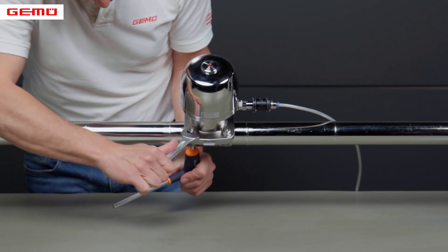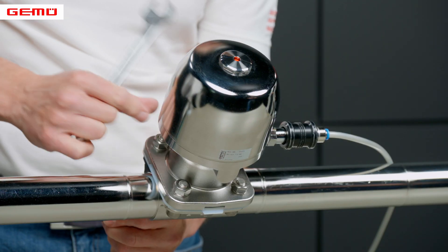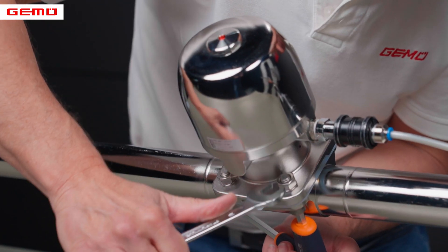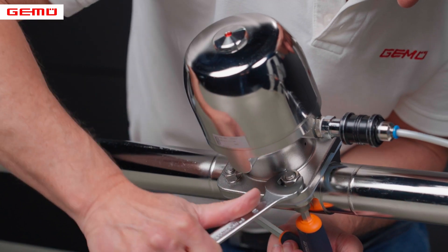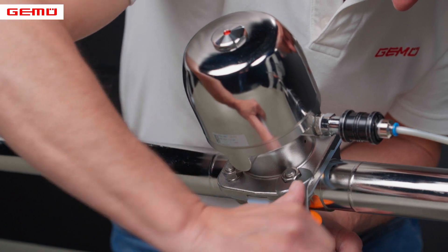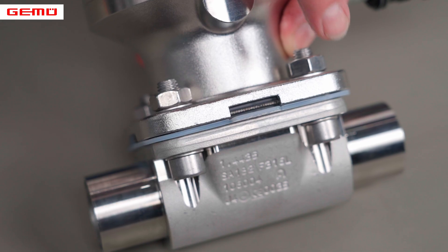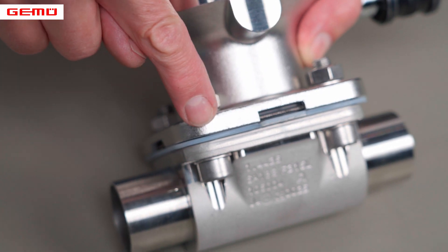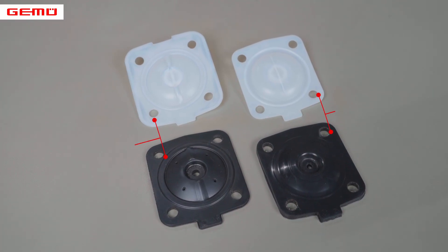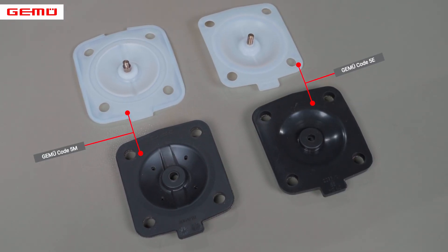Overtightened screws can have a negative effect on the function and service life of the diaphragm. Diaphragms are subject to natural setting behavior. We recommend periodically checking and, if required, re-tightening the threaded connections. Compared with the previous GIMU code 5E diaphragm that is tightened until a slight bulge can be seen, the GIMU code 5M diaphragm is fitted level and parallel to the valve body. A compression is not visible externally; this occurs internally at the optimized seal contour.